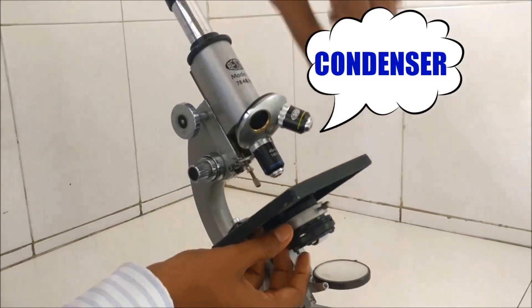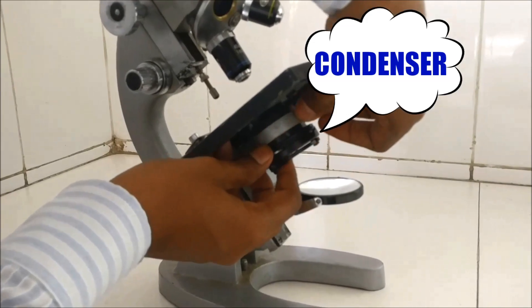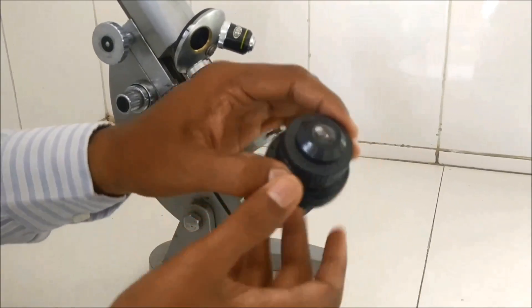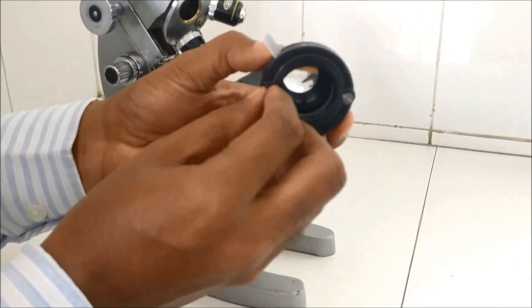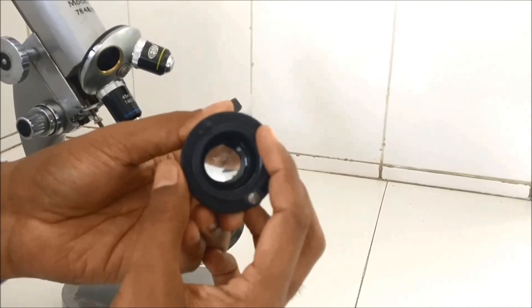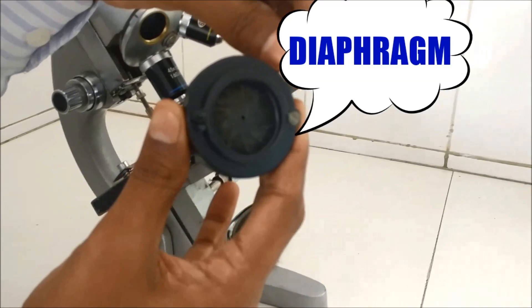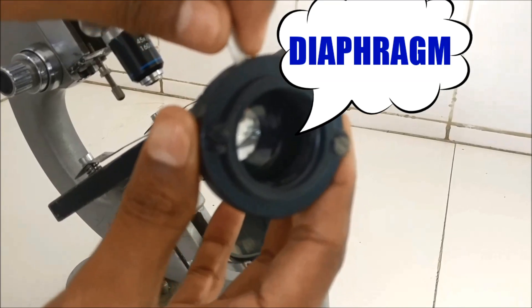This part that I am removing is the condenser, held by a small pin at the base of the stage. When we remove the condenser, we can see a converging lens, which converges all the light, and a part for adjusting the intensity of the light. At the center is the diaphragm, which opens and closes like a camera shutter.